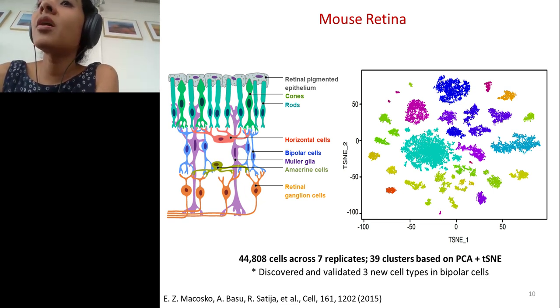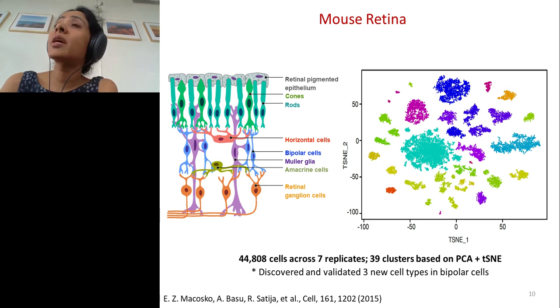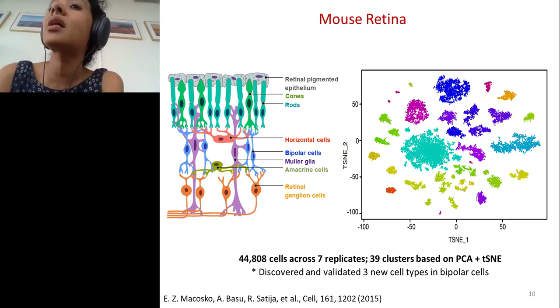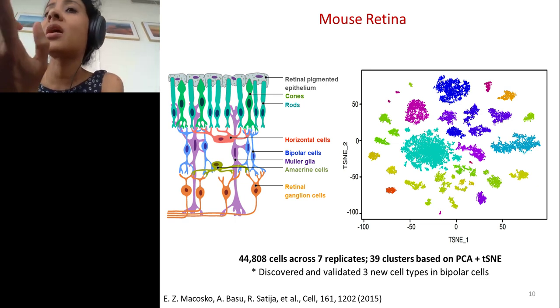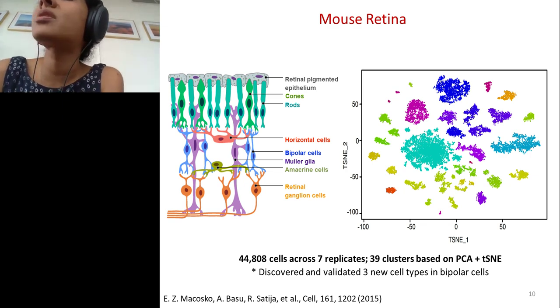What are these kinds of experiments useful for? They are good for looking at complex tissues, by looking at their RNA expression. We applied this technique to mouse retina for very young mice. And we see that for the most part, the bioinformatic analysis yields these cell types that can be matched to what is already known for the mouse retina. So, for example, these blobs are color-coded by the picture to the left. This kind of plotting is called a TSNE plot.